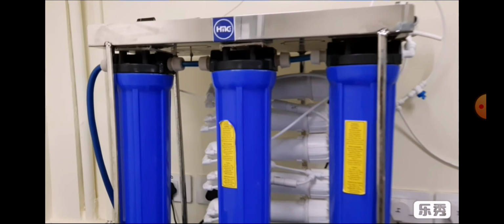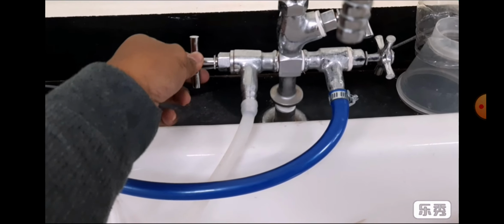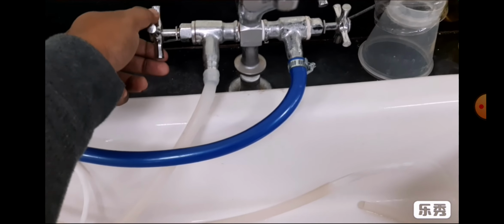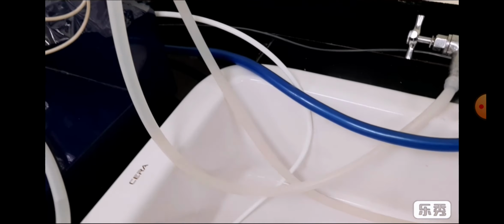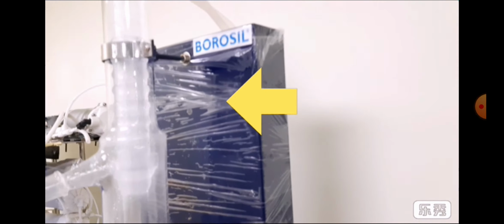Then next we have to start another pipe. Through this white pipe, which we have opened, the tap water will come to the condenser to cool the condenser, here in this way.